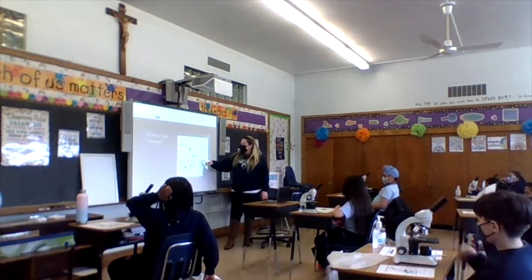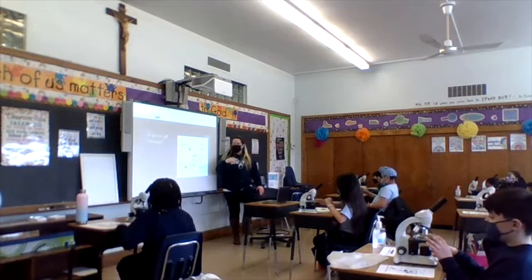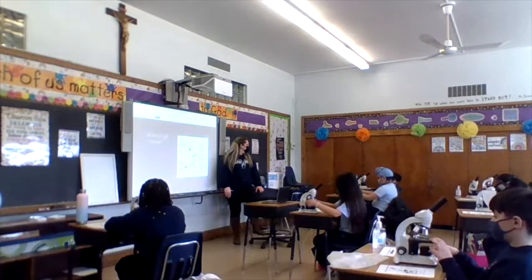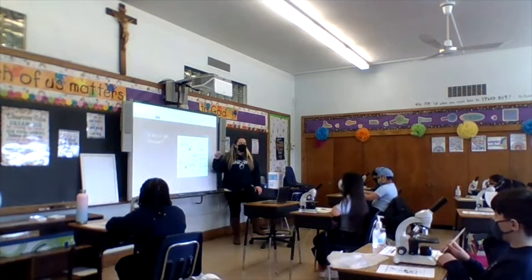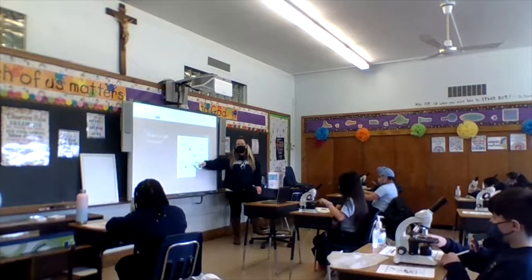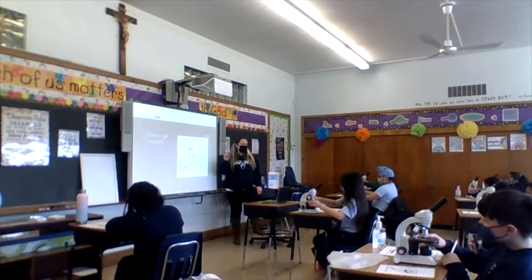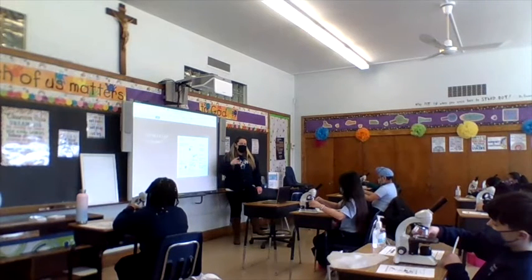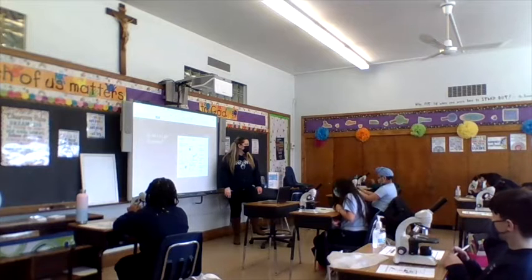Okay. Mechanical stage. Say mechanical stage. Find the stage on yours, it's the black platform. That's where the slide goes. Then you have the clips, touch the clips, the silver clips. Cheyenne is gently moving her clips. That's how it holds it into place. Remember the button in the back? I said you could tap that when you put it under. Gently, gently, good.